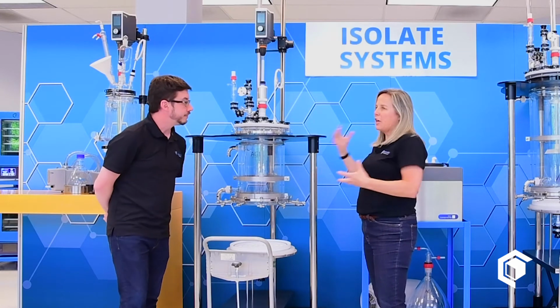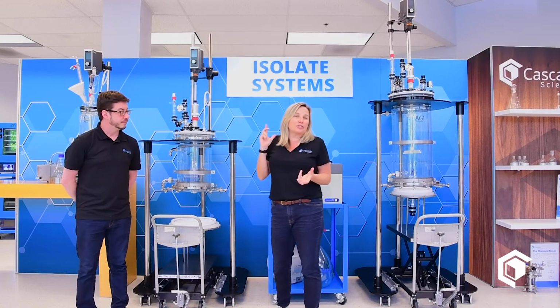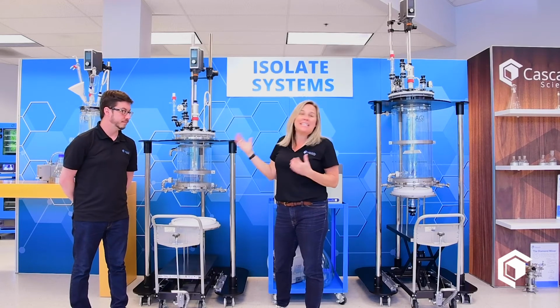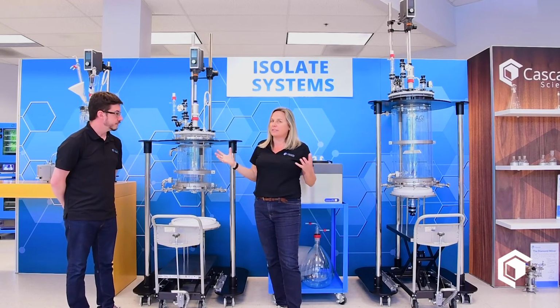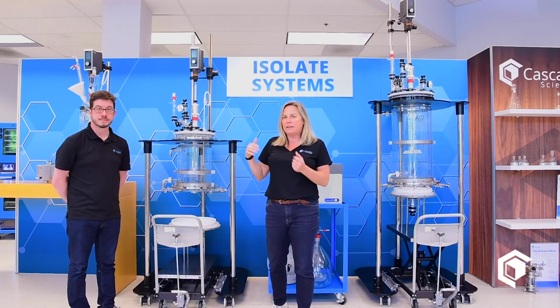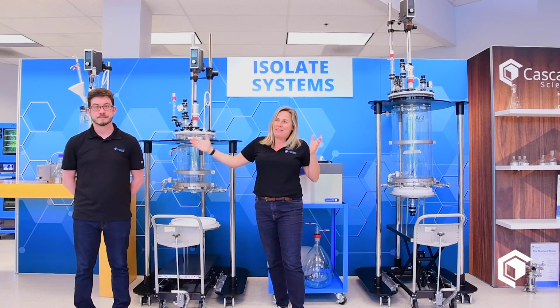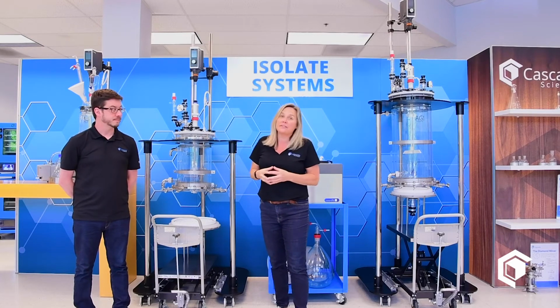And so would you say that on some of the more lower cost reactors, your glass temperature delta would be somewhere in, I've seen it about 60 C to maybe 90 C at best? The Asahi glass reactors, their temperature delta is again pushing 100 C. It's actually stamped on there, I think 110 C, but that cushion of the ability to withstand a 100°C temperature swing will forgive a lot of sins.